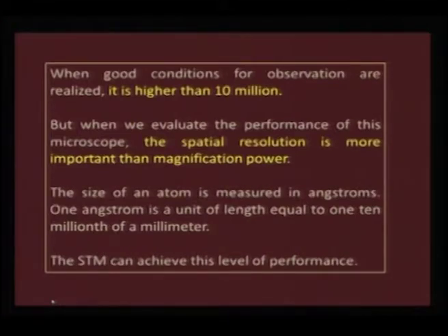What we also look at here is spatial resolution, which is far more important than magnification power, because when we talk about the optical microscope or scanning electron microscope, we usually look at the magnification, but here we are looking at spatial resolution. Therefore, this is an entirely different notion in microscopic techniques.